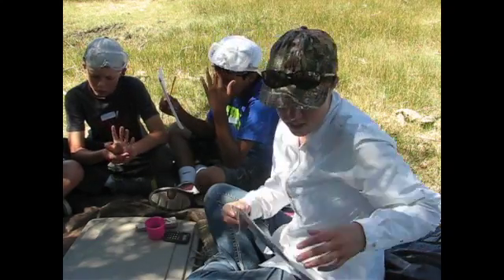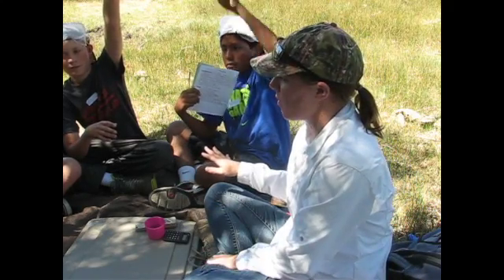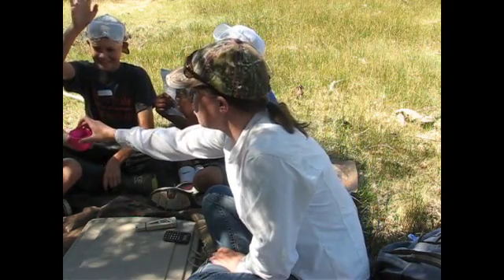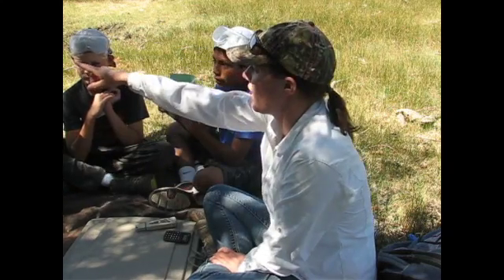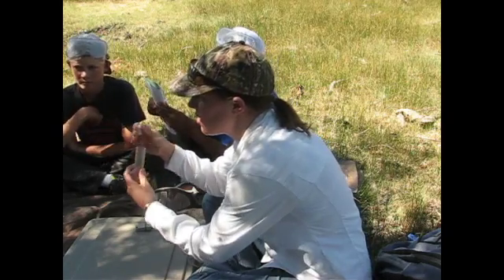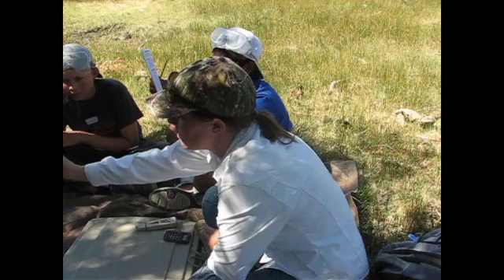So I need 2 volunteers to go down and get water. Who hasn't gone to get water? Troy, you have. All right. You two, if you'll go fill this one up to the black line, you can go right over there. See how it says 25 milliliters? Yes. Okay, I need you to fill it up to that line, and you can use this for small adjustments.